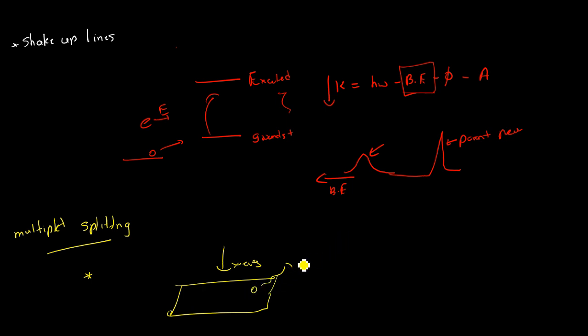The electrons are emitting from an atom, no? So if those atoms consist of unpaired electrons, then there's a problem. So then there is a possibility for the multiplet splitting. So when you have such atoms, you will see that your original peak is a little bit split. Maybe into two peaks, three peaks, or it's just a small hump like this.